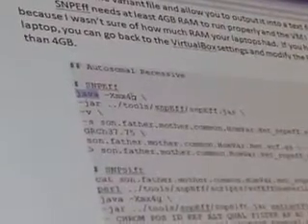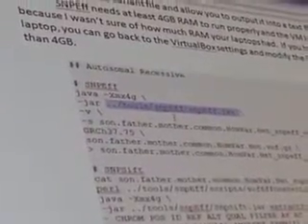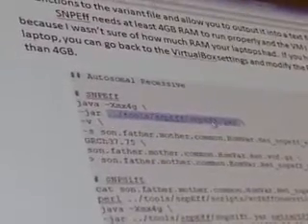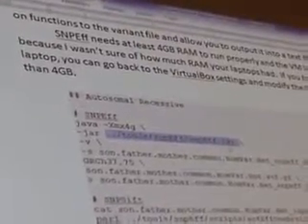I was telling it that I only needed so much RAM, because I didn't want to overburden my virtual machine, since it can use a lot of RAM. Then I pointed to the path where I had installed SnpEff on my machine. It's in the tools folder under the SnpEff directory, and this is the jar file I'm calling.